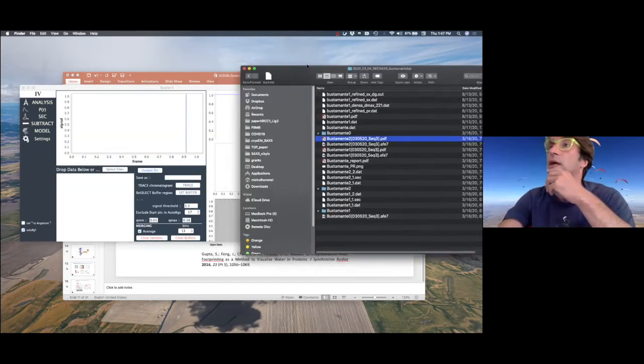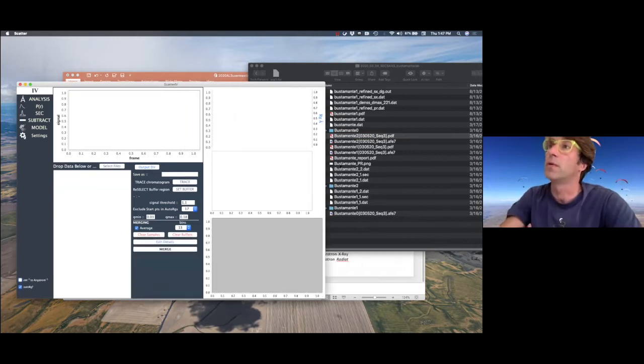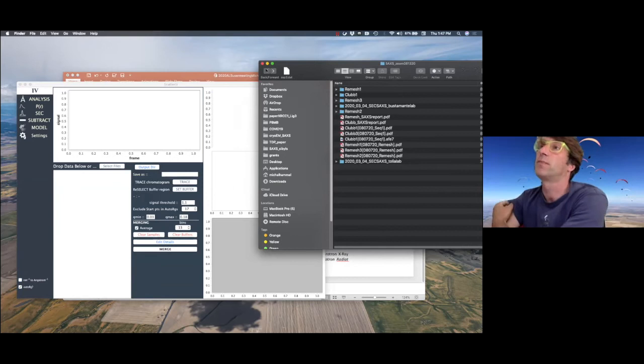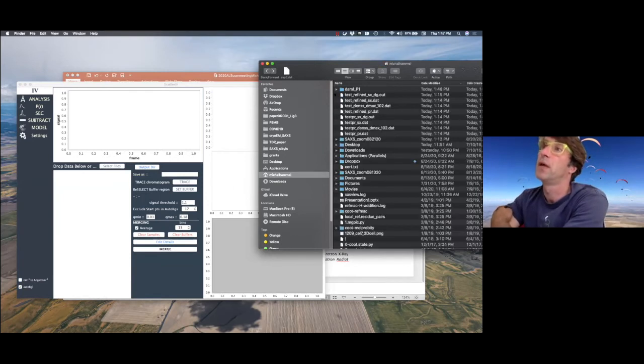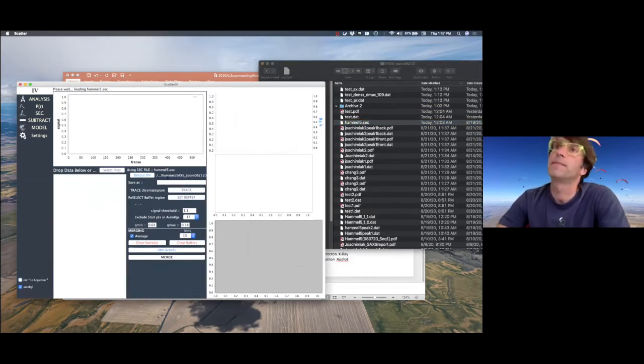Before I go to present my own science, I'd rather repeat what Rob already did for a very simple problem, but let's do it for much more difficult problems that normally people send us. So I prepared here the SEC file, so we can go straight and upload it to the scatter.